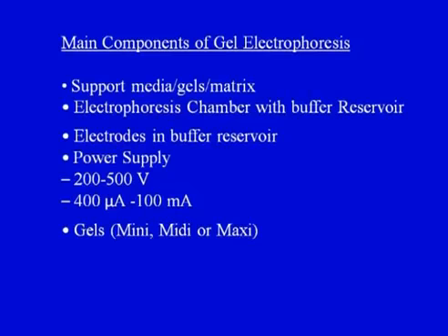Now, in this lecture we are going to extend our discussion on electrophoresis and discuss gel electrophoresis. Mainly two kinds of gel electrophoresis techniques are widely used.